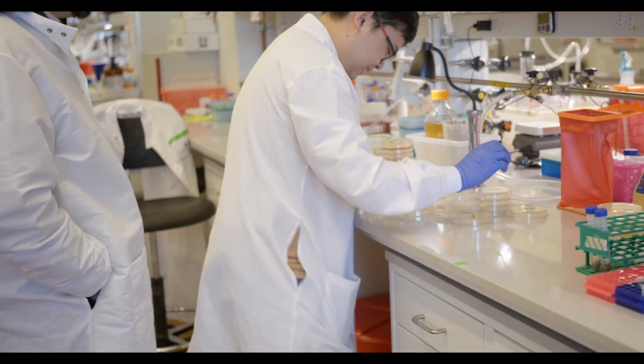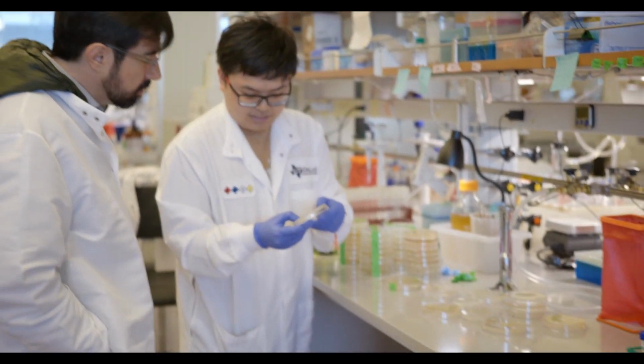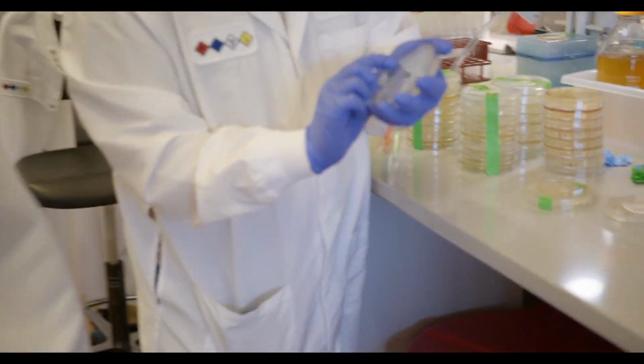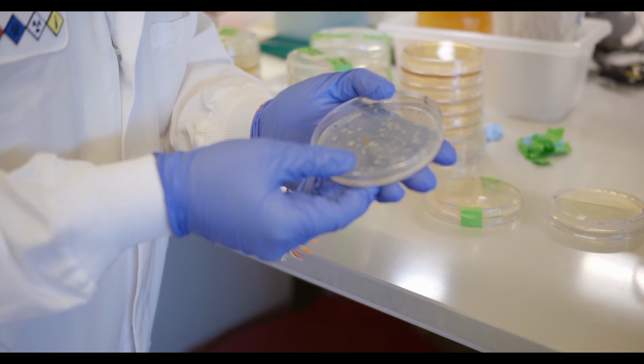I saw a shot of orange. Yeah, there's a lot of orange. There's black bacteria, yellow, and then there were some green ones and pink ones.